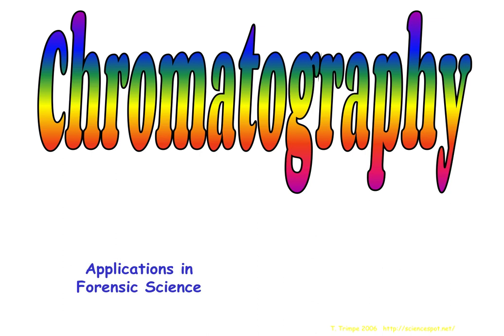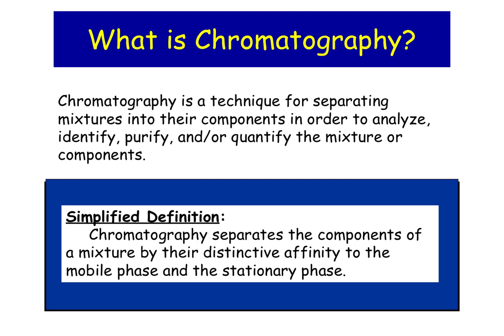Hi everybody. Today we're going to be talking about the concept of chromatography and what it means for forensic science, how do we use it, and how can it be useful. So chromatography itself is a technique that we use in science to separate mixtures.